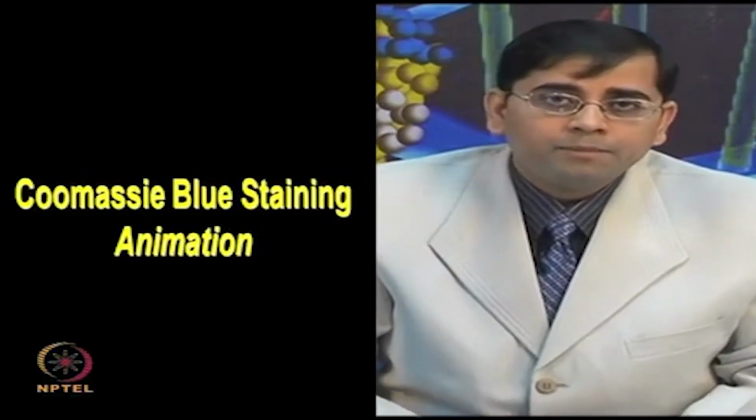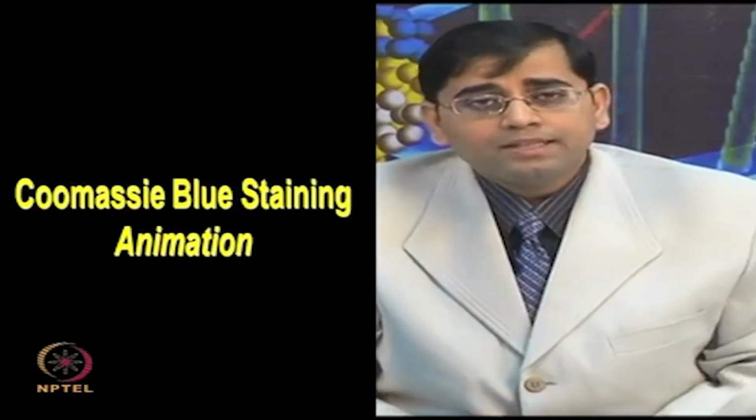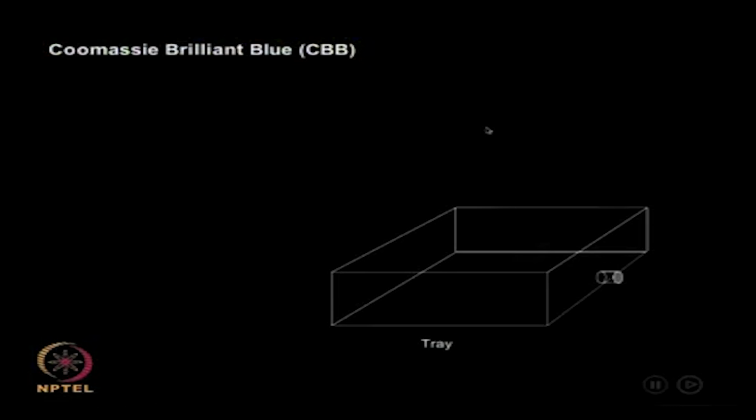So, I will show you one animation of how to perform the Coomassie blue staining. In this animation, I will show you how the staining can be performed by using Coomassie Brilliant Blue stain.